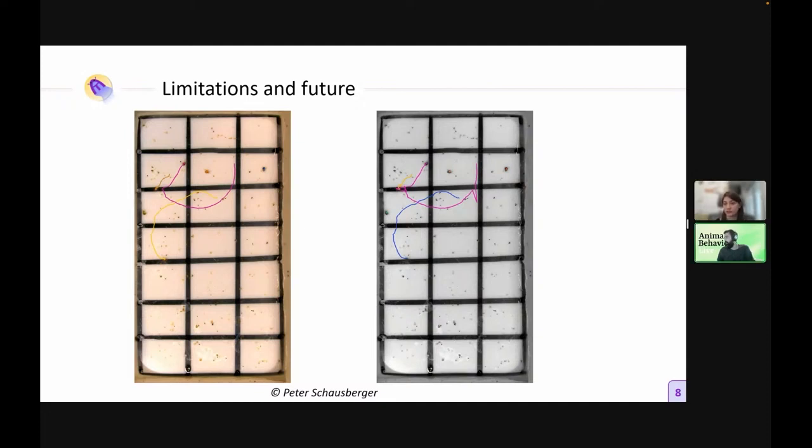Okay. So we receive all the comments. Engmar31, thanks for a great piece of software. Is there a way to extract frame sequences where ID swapping likely happens? This would allow for faster quality control checks. Yeah, that's a very good point, and it's not the first time that someone has told me that. It will be in the next update. I didn't present all the features of the next update. For the moment, it's not there, but it will be. Okay, so Engmar31, stay tuned for the update.